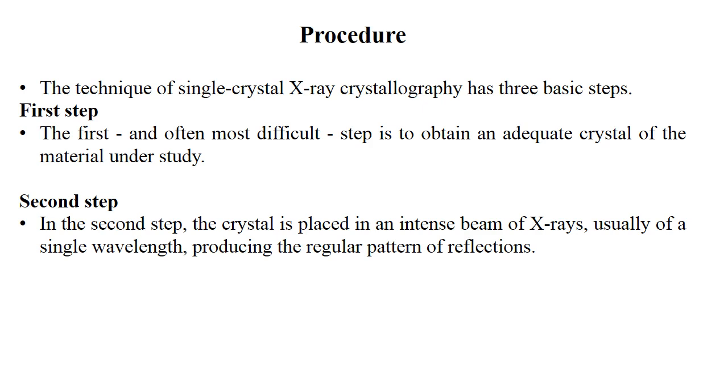And this crystal should be rotated to different sides. If the crystal is placed on a specific side and we hit the X-rays and get the reflections, when the crystal is rotated, the diffractions or reflections we were seeing will disappear, and new diffractions or reflections will appear.